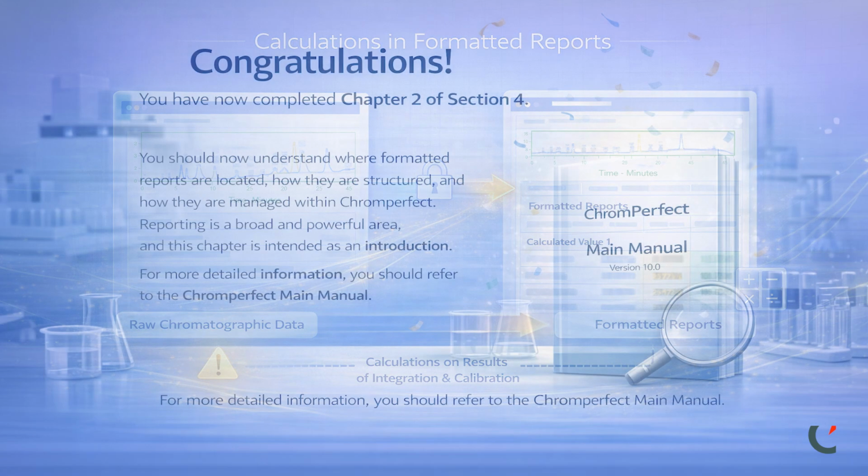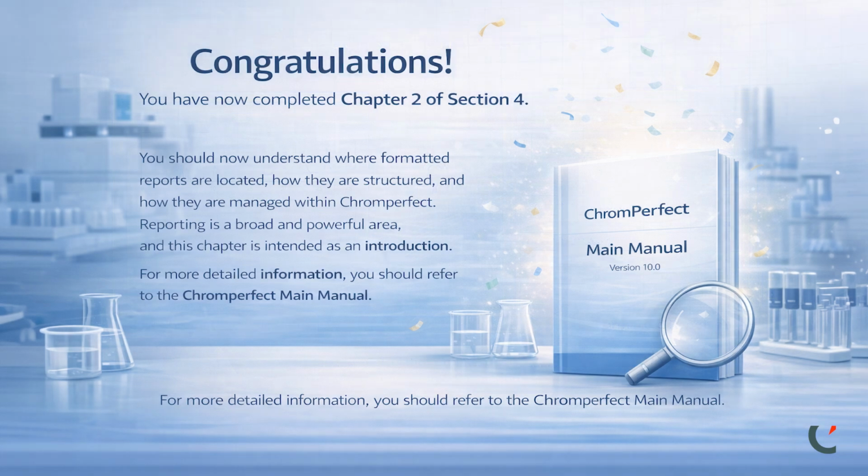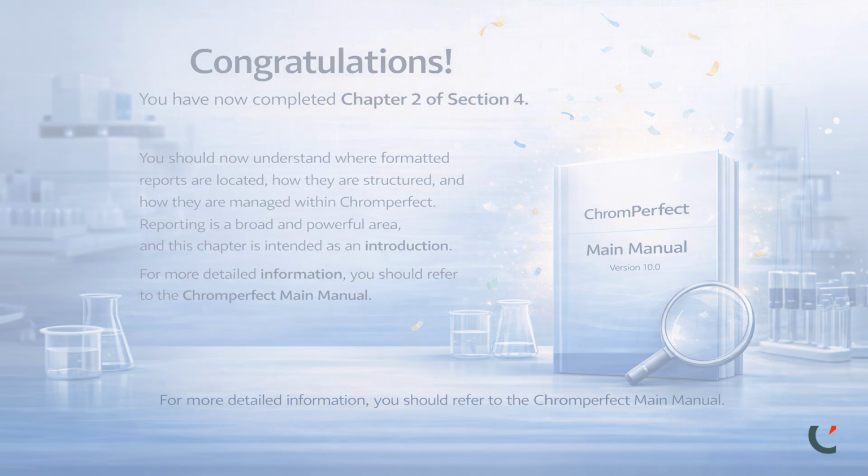Congratulations! You have now completed Chapter 2 of Section 4. You should now understand where formatted reports are located, how they are structured, and how they are managed within Chromperfect. Reporting is a broad and powerful area, and this chapter is intended as an introduction. For more detailed information, you should refer to the Chromperfect main manual. In the next chapter, we will look at how reports are generated, selected, and applied during analysis, including how multiple reports can be produced from a single method.